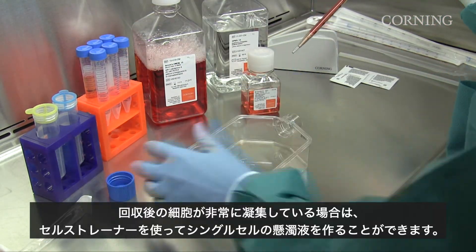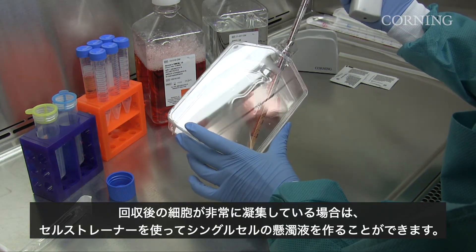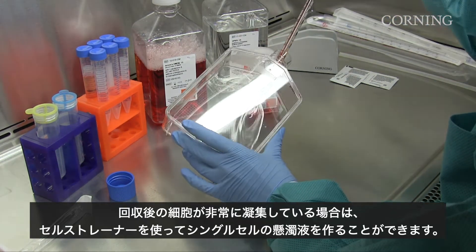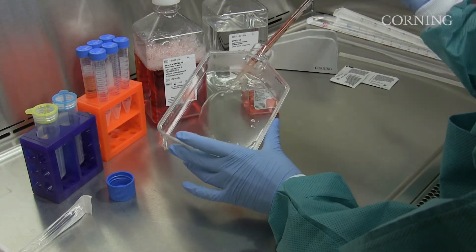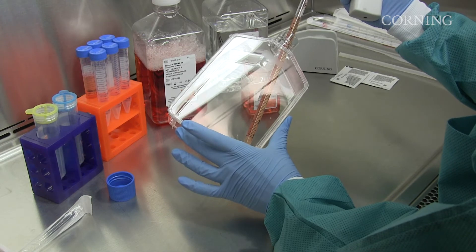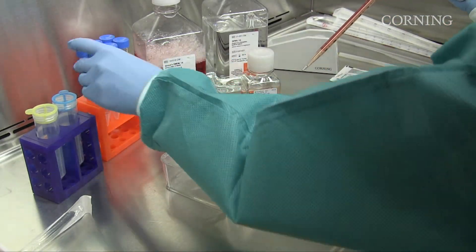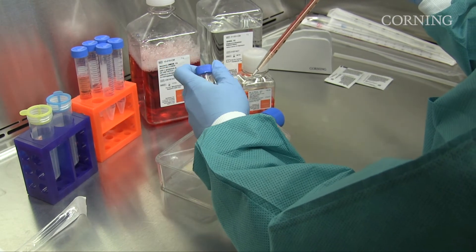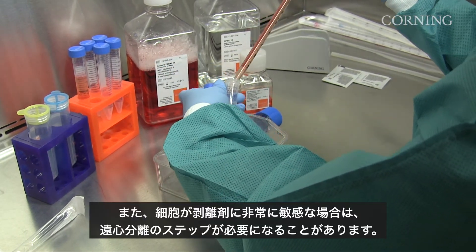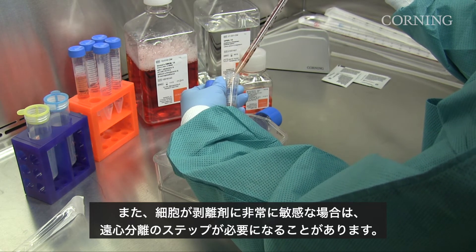In case the cells are very clumpy post-harvest, you can use a cell strainer to achieve single cell suspension. Also, if your cells are very sensitive to the dissociation reagent, a centrifugation step may be necessary.